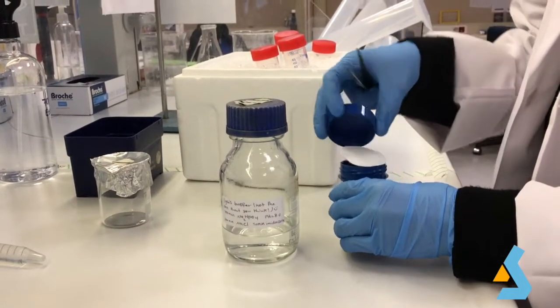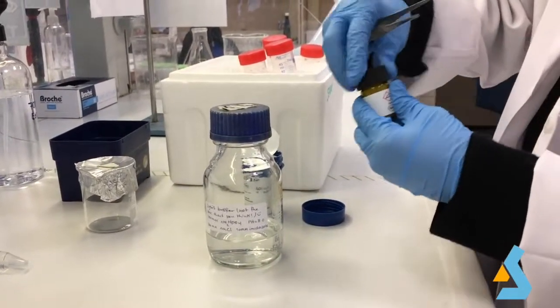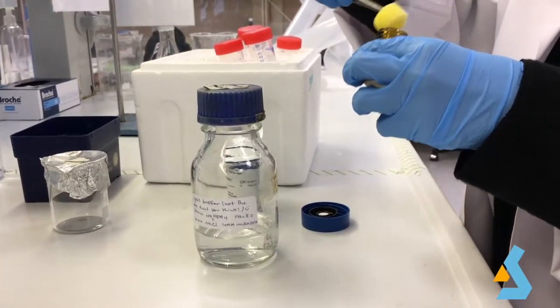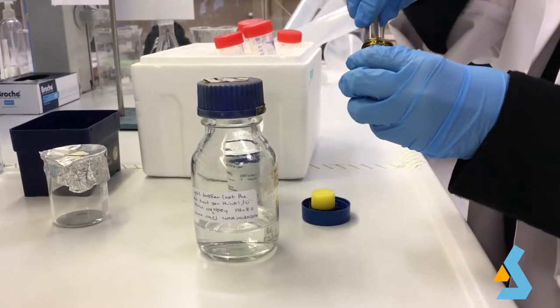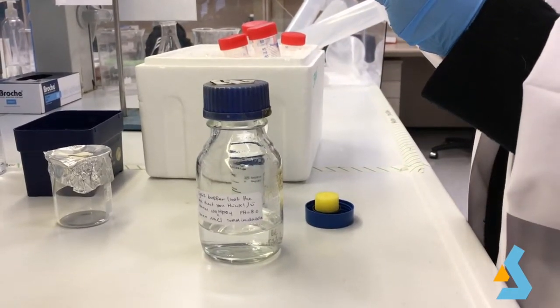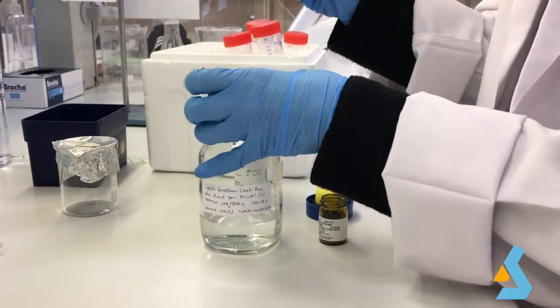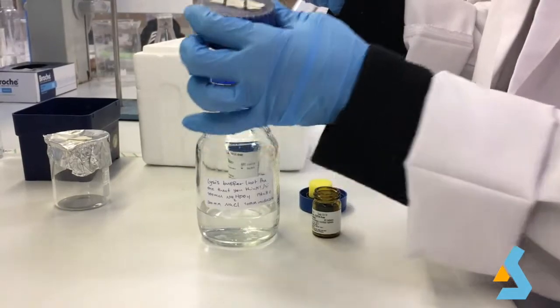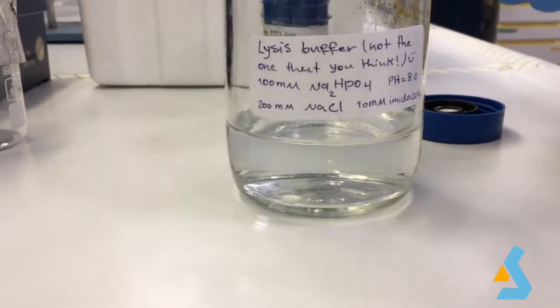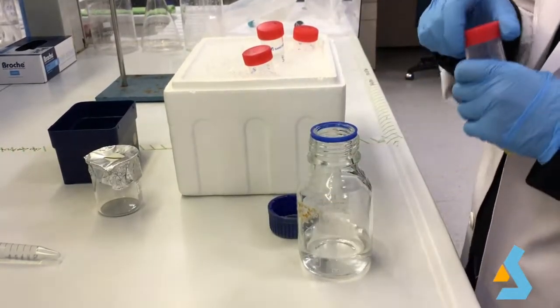First, we need the lysis buffer, to which we add 1 tablet of protease inhibitor to prevent the proteins from degradation. Then we add 50 ml of lysis buffer in a tube, mix and vortex well.